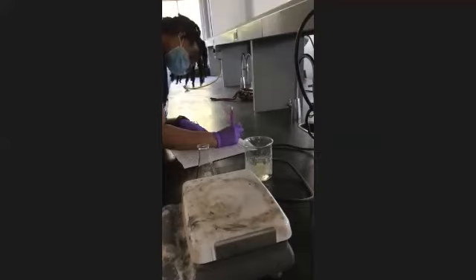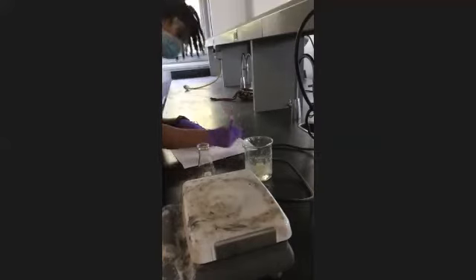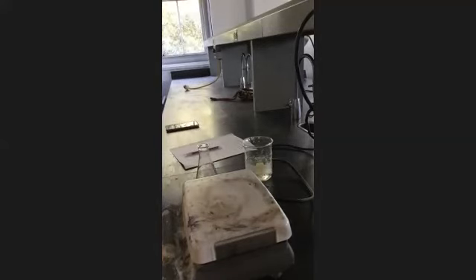My bad. You all right? Don't look at it. Let me show you the trick. I'll just grab it here. Don't grab them on the side. Grab them on the top. It's fine. We're going to put some ice in here. Get it back.